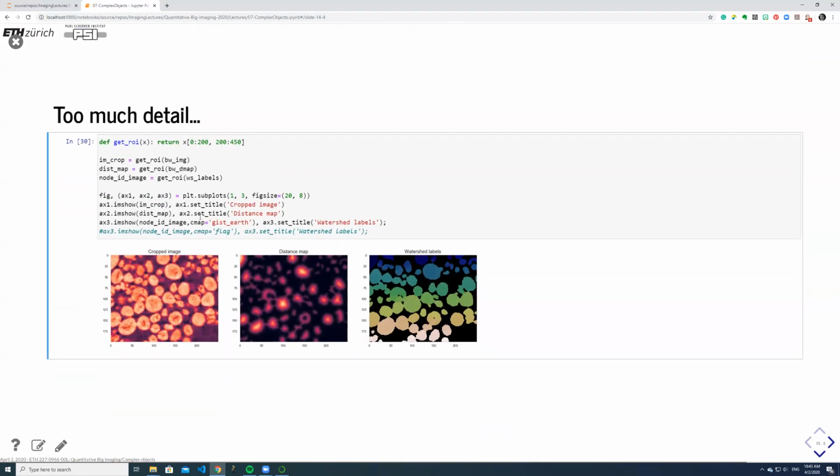And to get a little bit more detail, there was a little bit too much, so we crop it and look at a tinier area. So we have the image here, the distance map that it produced. You can see that there are some interesting places around here, the rings, the crests, and so on.